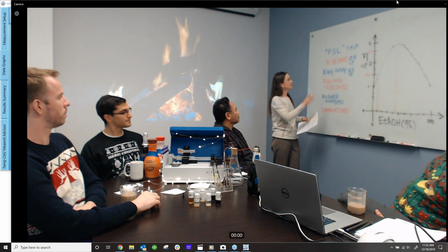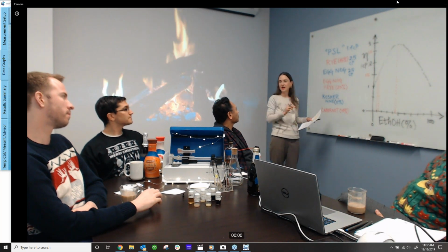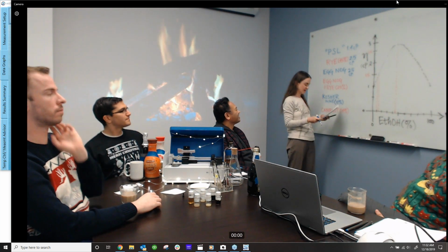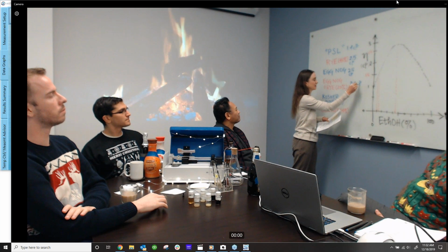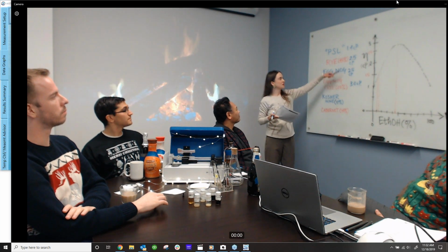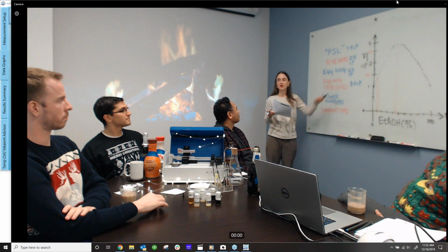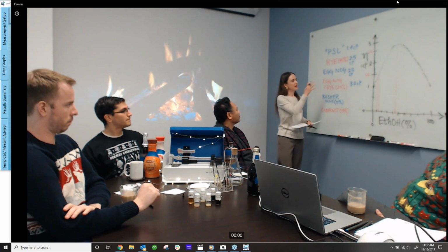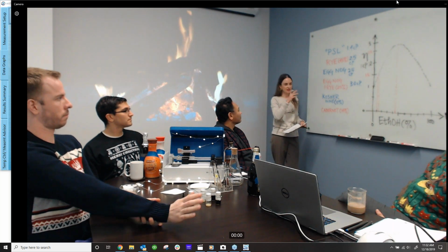And then because the best eggnog has a little rye added, we did that mixture at 20% of the rye whiskey. And in this case, now the viscosity comes out at 3 centipoise. So this is kind of interesting. You're taking two things that are about the same viscosity and mixing them together, and you get something higher. At first glance, that seems a little odd, but again, thinking about the fact that we have alcohol-water mixtures in play, that's going to influence it too.